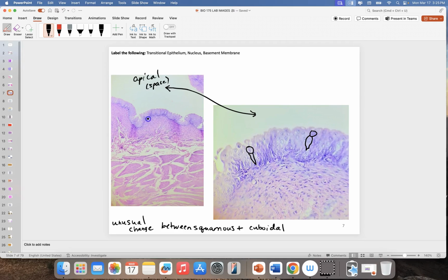We know that where the epithelium connects down to this next layer, this connective tissue layer, that's going to be our basal layer there. That's going to be our basal portion. And I'm going to make this line just a little bit nicer for us there. That way we can really see the basal side, again, before we get to that connective tissue.